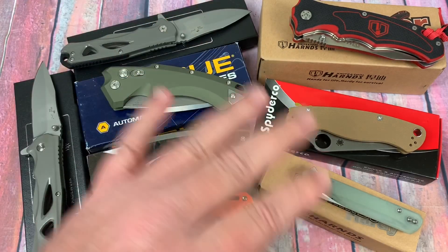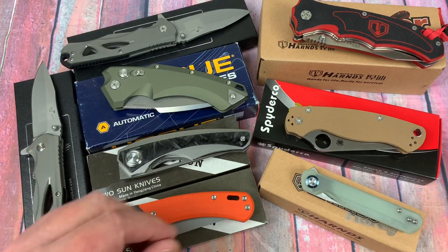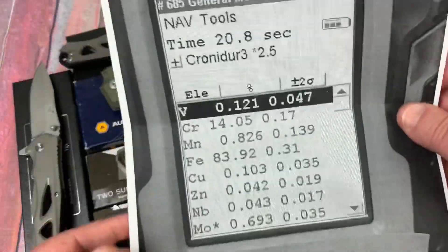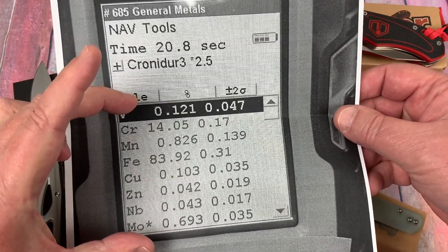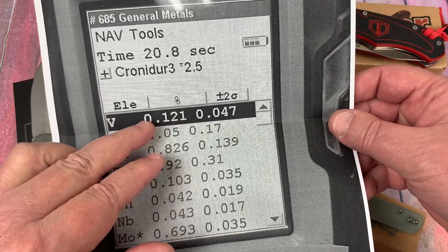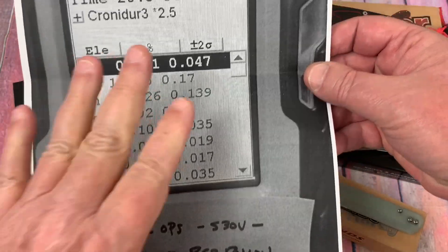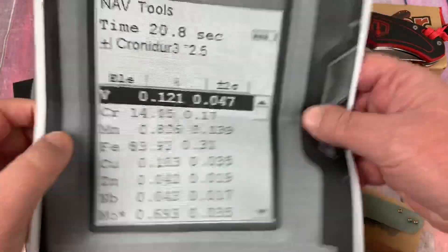I bought a second knife and had that tested, got back with Bear Ops — the second one didn't test as S30V either. Then a viewer sent me one in black G10; I tested that and it also looked like 8Cr13. Here's the information from the analyzer on the elements: you've got 14% chromium, that's fine — but look at the vanadium. The vanadium ought to be 3.5% or higher; this is not. This group of numbers looks like 8Cr13. The person who did this reading has a degree in metallurgy, so I'm good with that.